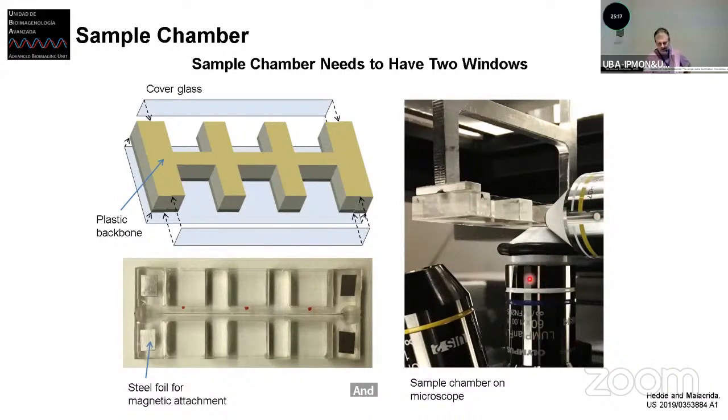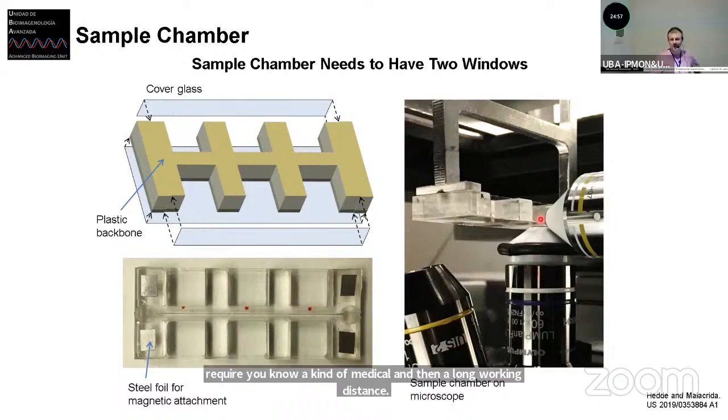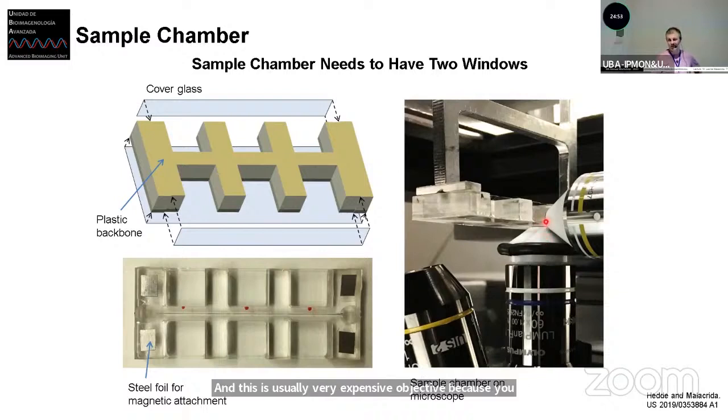emission. The big requirement here is that this objective needs a high numerical aperture for the purpose that we want, and also a long working distance. This is usually a very expensive objective, because you need to travel through this one millimeter thick resin and then pick the height of your cell. But this objective does the work.